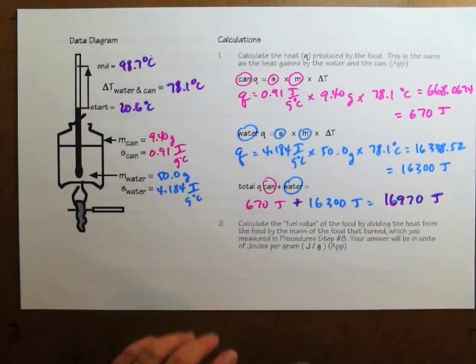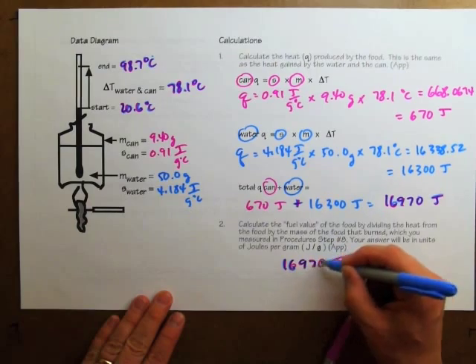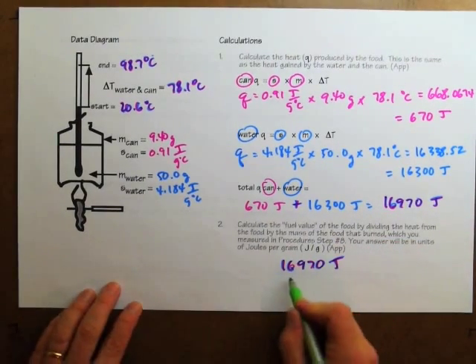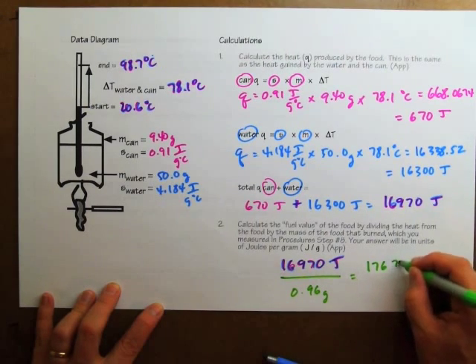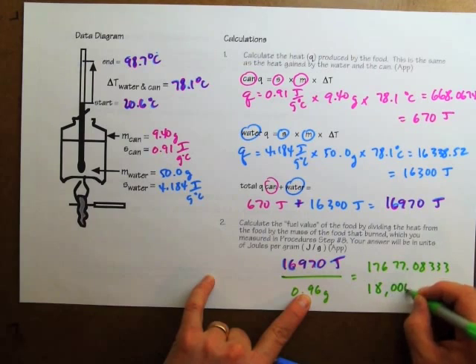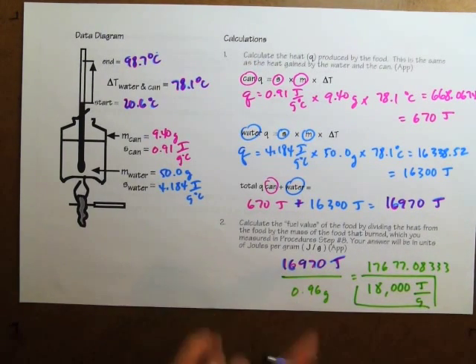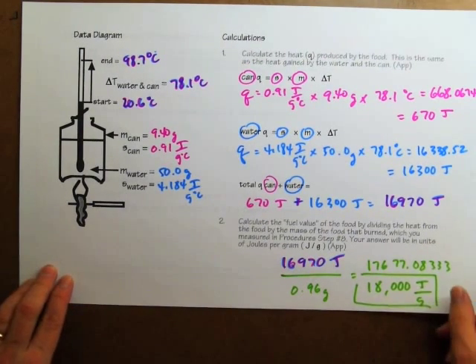Let's find out what the fuel value was. We'll divide how many joules of heat came out of the Cheeto when it burned by how many grams of the Cheeto burned — dividing by 0.96 grams. The calculator says 17677.08, which rounds to two significant figures: 18,000 joules for each gram of Cheeto. That result is probably less than it should be, just as we found with the candle analysis — we did not catch as much heat as expected, so this answer is probably just as off. But since we know how wrong the candle one was, we can do a calculation to correct for the inaccuracy.